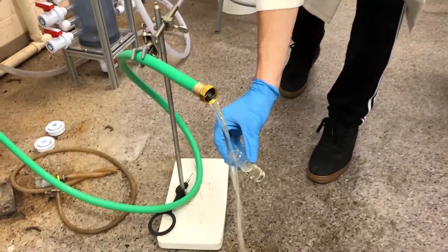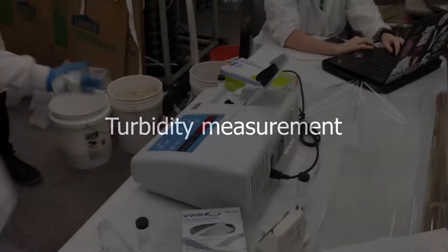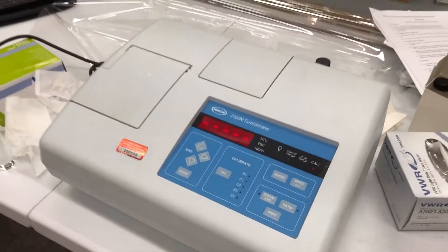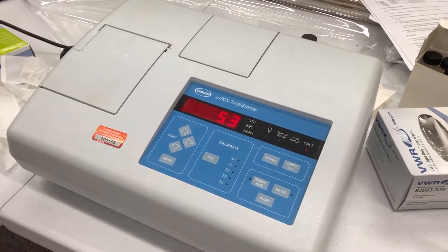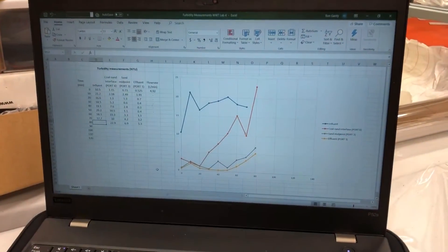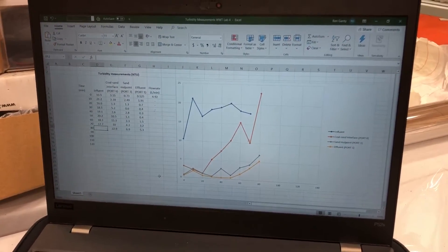Now we're going to take our effluent sample — that's how we're measuring turbidity of the effluent. For measuring turbidity, we just insert the vial into the turbidity meter. What's our time point right now? 80 minutes, and we're getting a 5.3 reading. That's the effluent sample — so 5.3 NTU on the effluent. And there's our plot. The coal-sand interface really jumped up that time, probably because of the way I was messing with the sampling port.